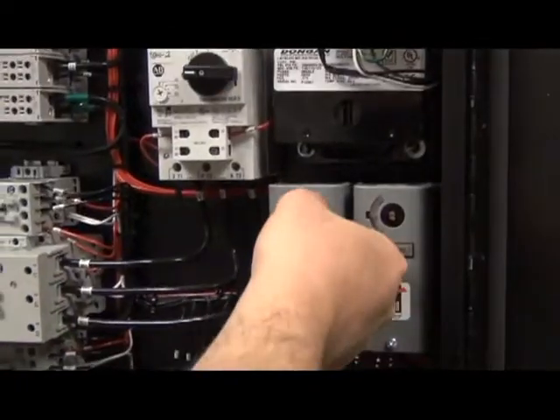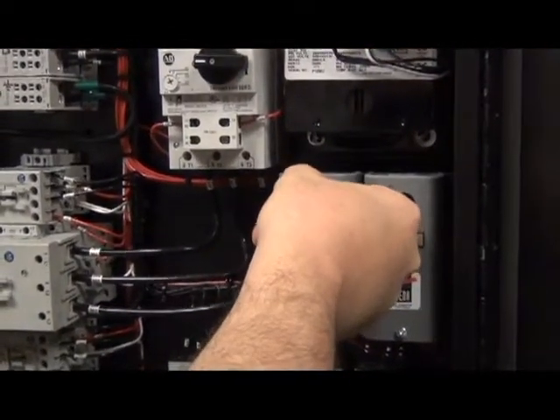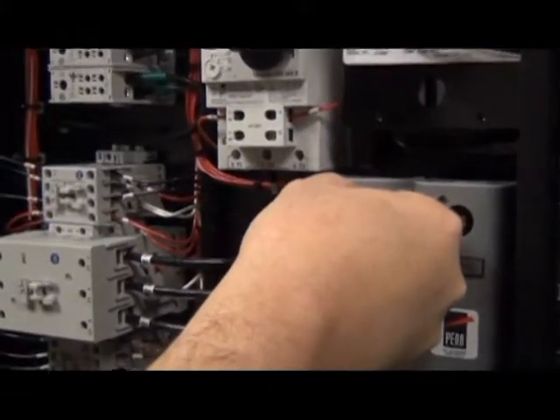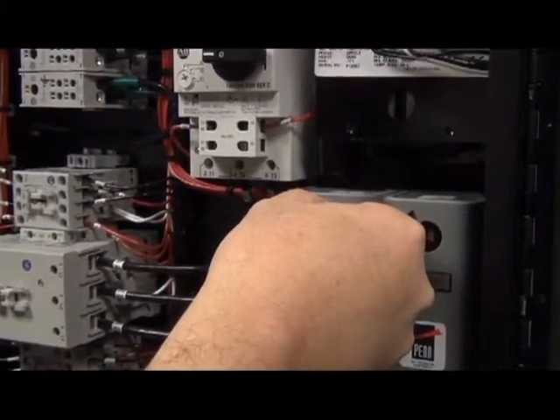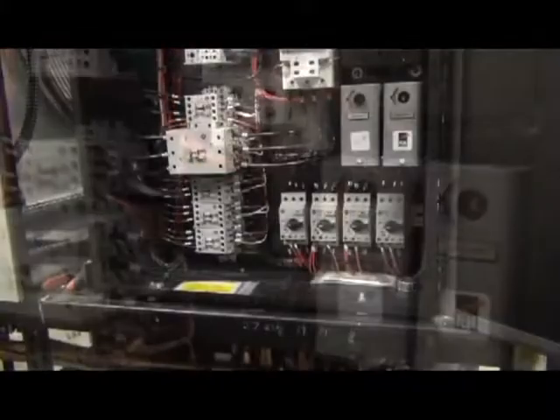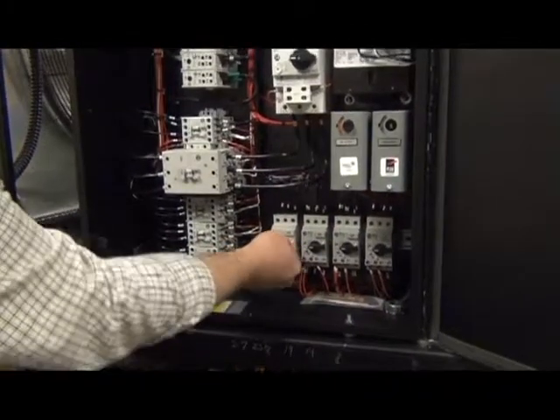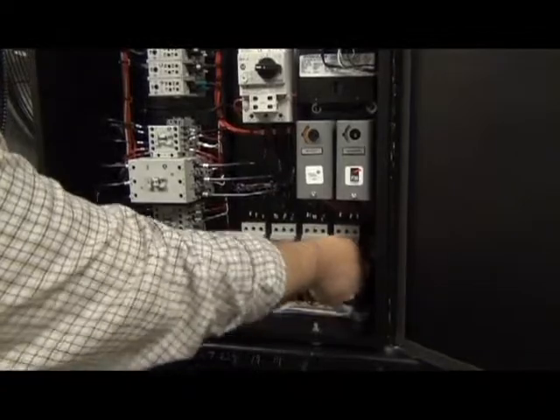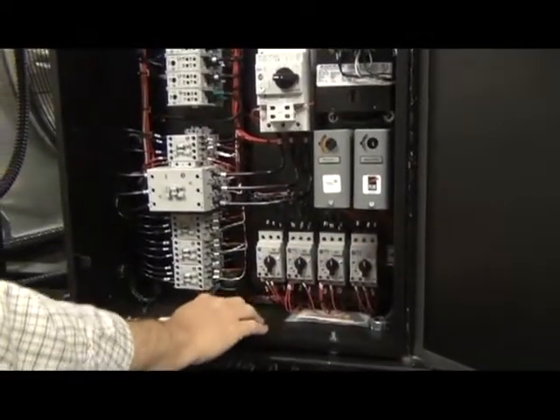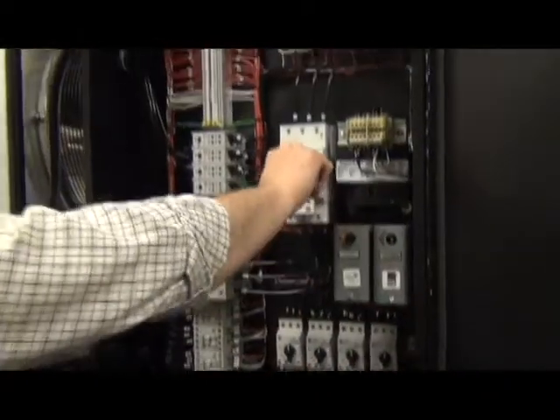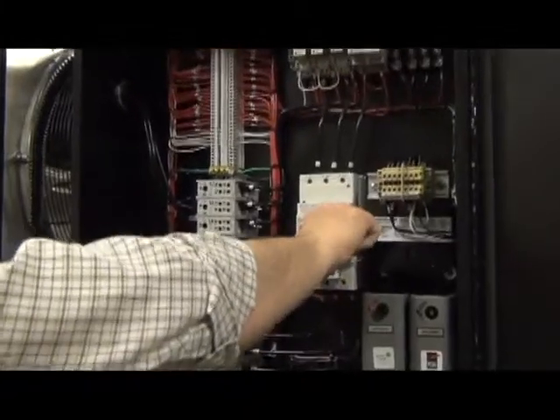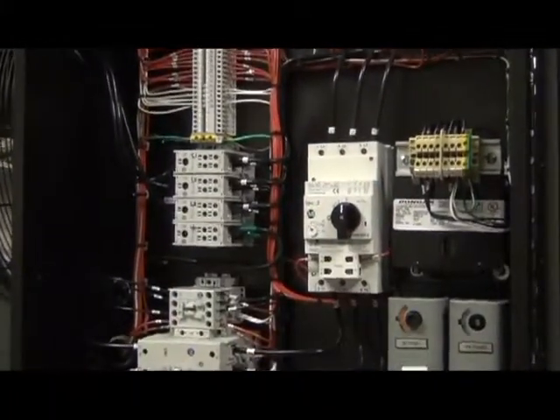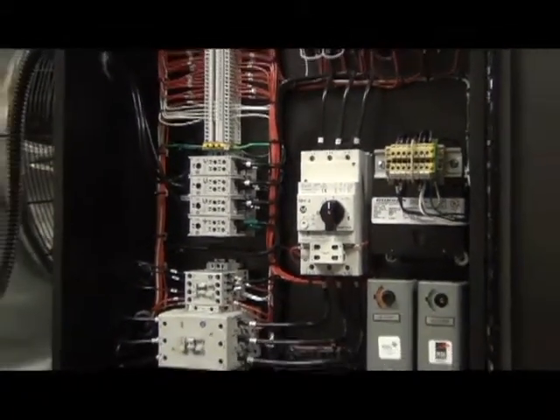At this point you want to verify that your set point thermostat is set to its proper setting, I believe in this case 46.4 degrees. Next we want to ensure that the breakers are all turned on. These breakers have been factory set for their proper settings at the factory. You just need to turn them on, make sure they're in the right position, as well as the compressor breaker. Once those are all on, then we can start our pump.